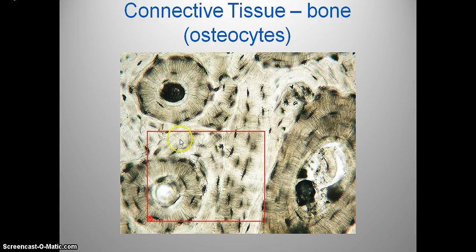Right here, these are osteocytes. An osteocyte is a cell of a bone. Right here is one, another one, another one, another one. And again, these are protrusions leading out. Obviously, the blood and nutrients, everything is needed in a cell. Cell is alive, bone is alive, but I'd like you to pay attention to the space outside. These are again collagen and other proteins and inorganic substances collected in the bone and a matrix, making it really hard. These channels are blood vessels.